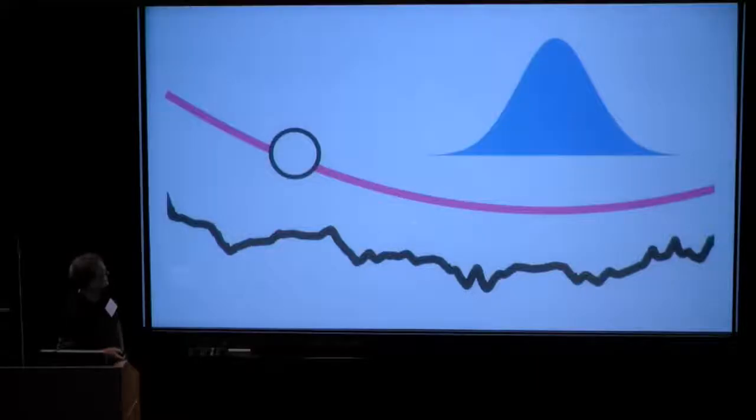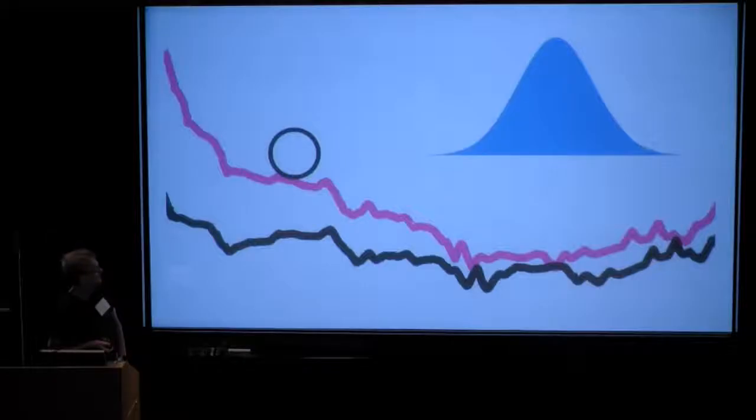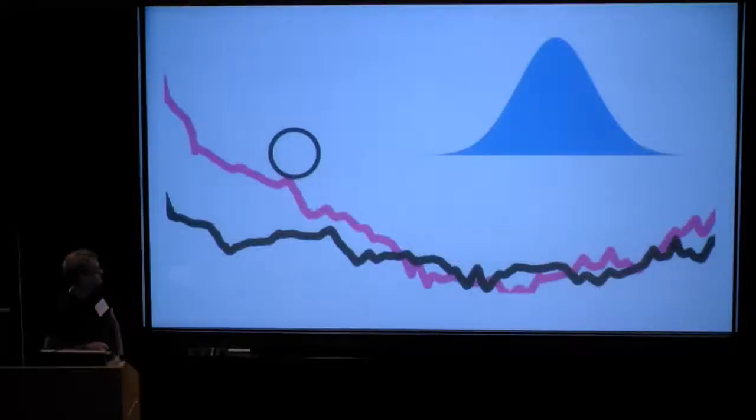There are a few things that we might need to tweak. If you have some sort of black line here, that would be the underlying molecular mechanics function, and then we have a very weak fitting potential. The problem is that when you add these to each other, we might still get stuck because the molecular mechanics might create energy barriers. That means that we won't go on. So sometimes we need to bump up the force constant a bit, so we apply more of the fitting potential here, or even more.